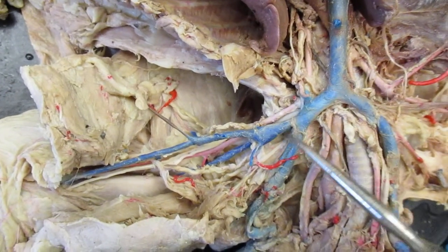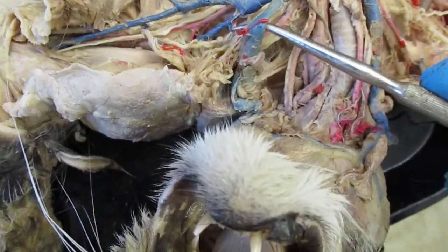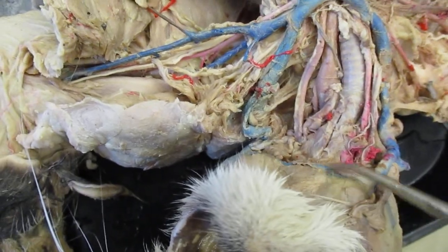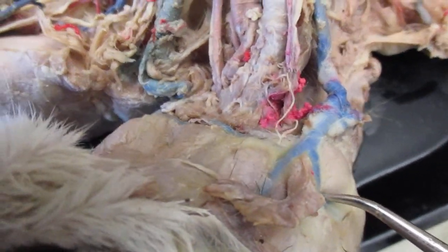So subclavian vein, jugular vein here. So your left and your right, and your transverse jugular right here, and then your anterior facial vein and posterior facial vein.